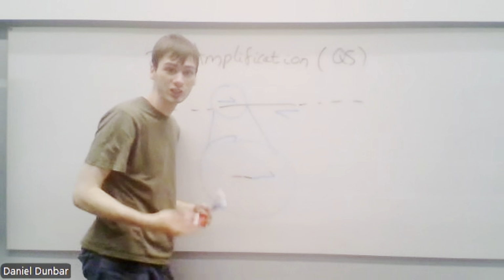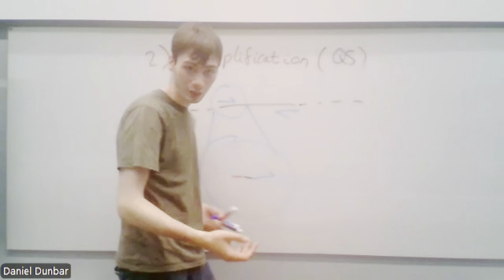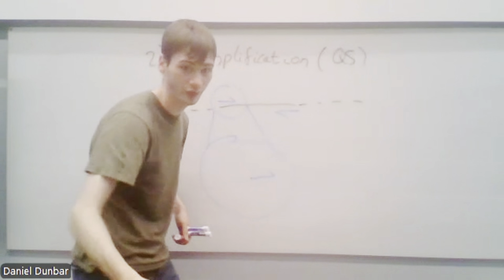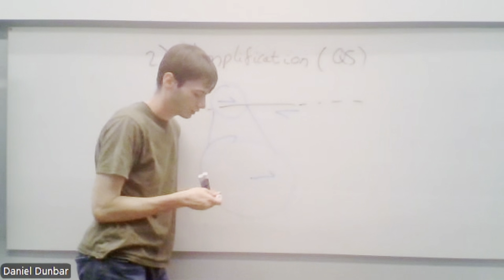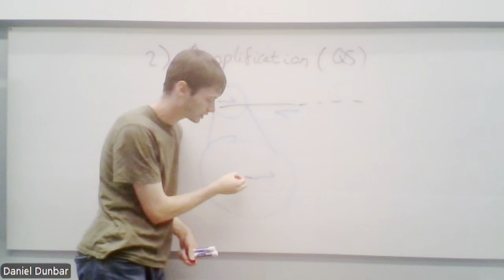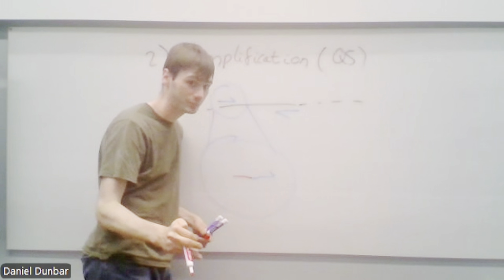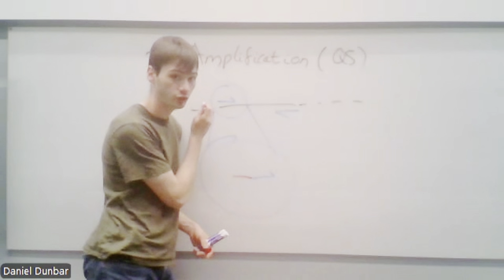And I would then be able to assemble that into an appropriate vector. Alternatively, I might look at Gibson. And if I was looking at Gibson, then I would expect to see a 25 base pair homologous region to my plasmid that I'm going to assemble it into, not to the genomic DNA.